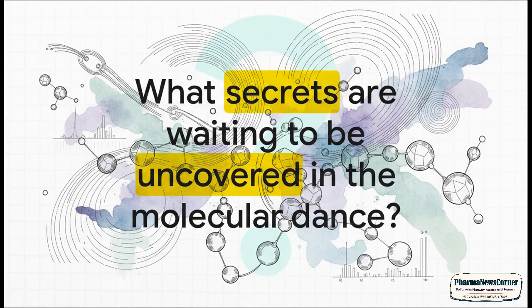So IR spectroscopy lets us listen in on this silent, invisible dance that molecules are doing all the time. Every single molecule vibrates with its own unique signature, a fingerprint that tells us its story, its identity. And that really just leaves us with a final question. As we get better and better at understanding this language of vibrations, what other secrets are just waiting to be uncovered in this molecular dance?